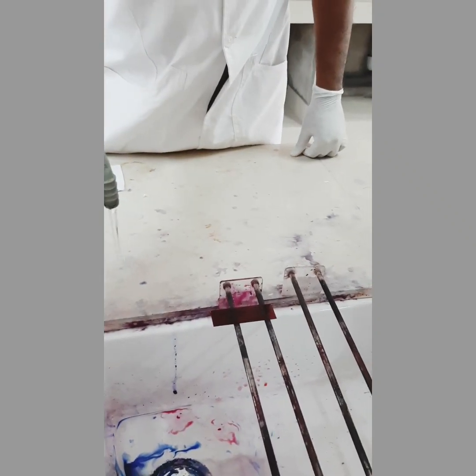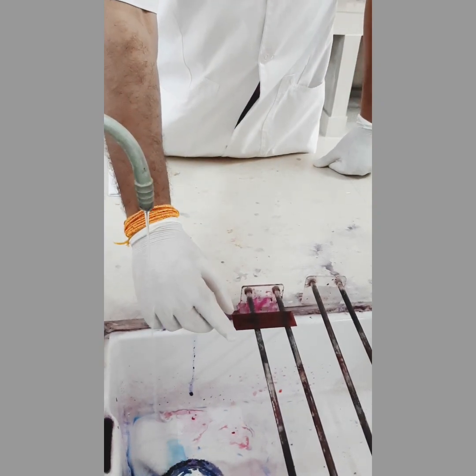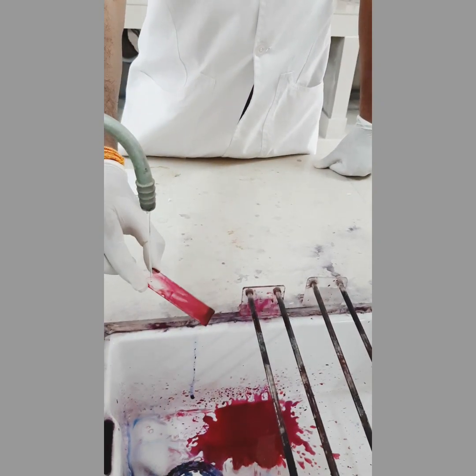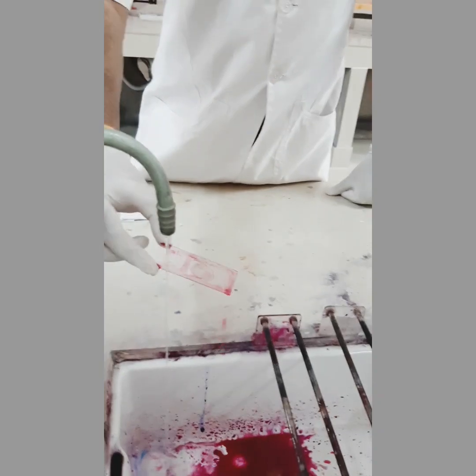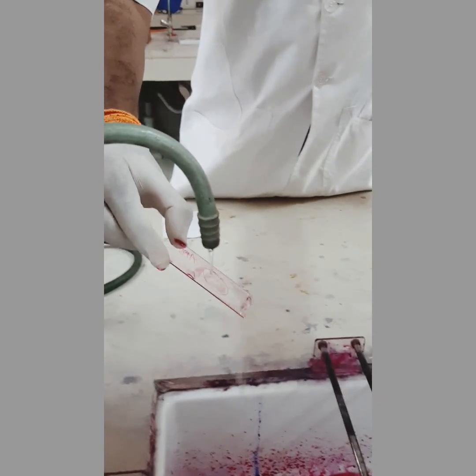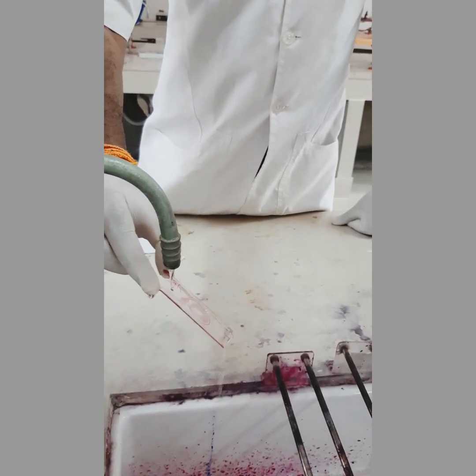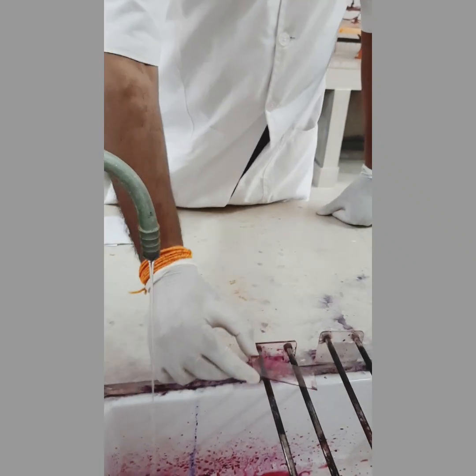After waiting 5 minutes, wash with water. Then the next step is decolorize.